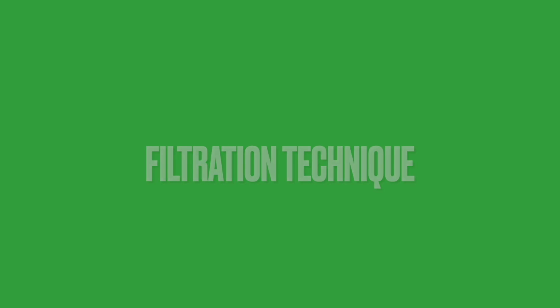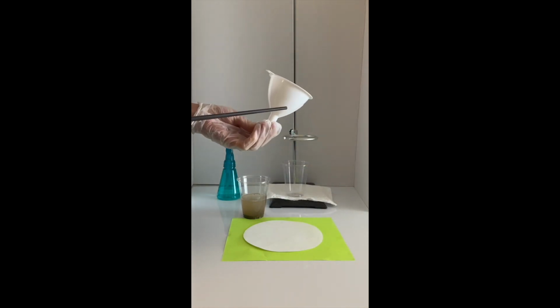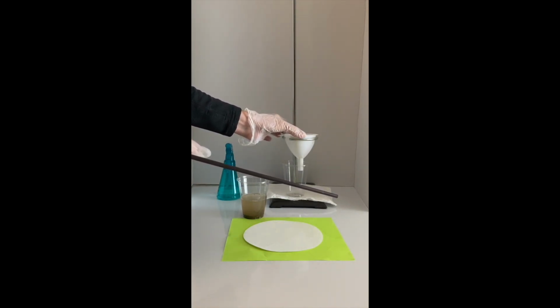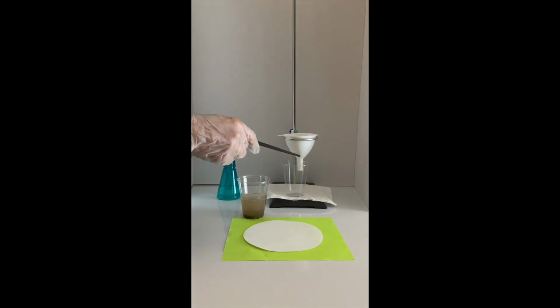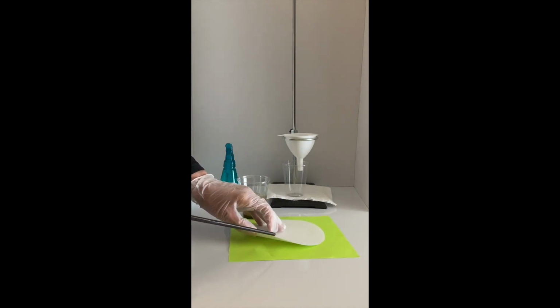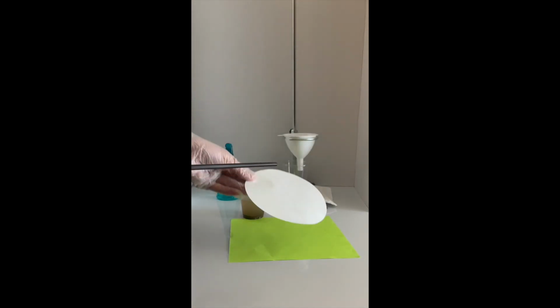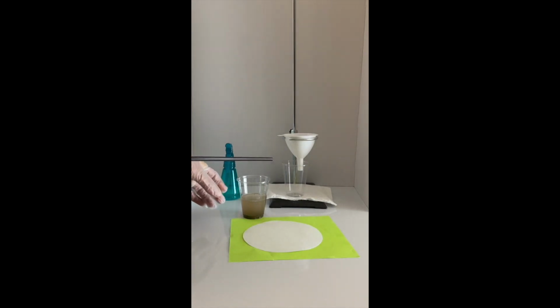Filtration technique. We will demonstrate the filtration method, but first let us examine the apparatus used for the process. Here we have a retort stand with a ring frame attached used for holding the filter funnel. Below the filter funnel is a collection container. We are using a disposable plastic cup. Next, we have the filter paper, the circular sheet of paper that functions as the porous medium. It contains very tiny holes or pores that are not visible to the unaided eye.